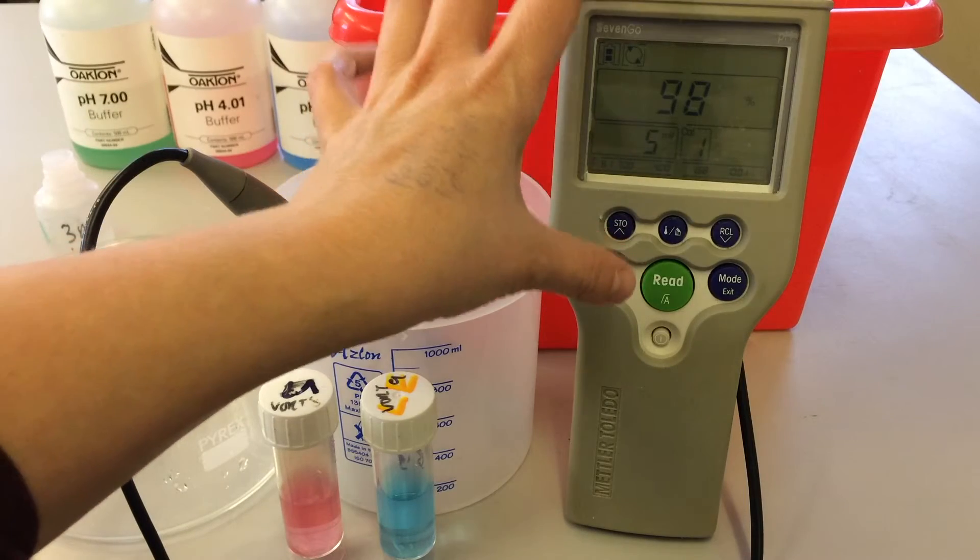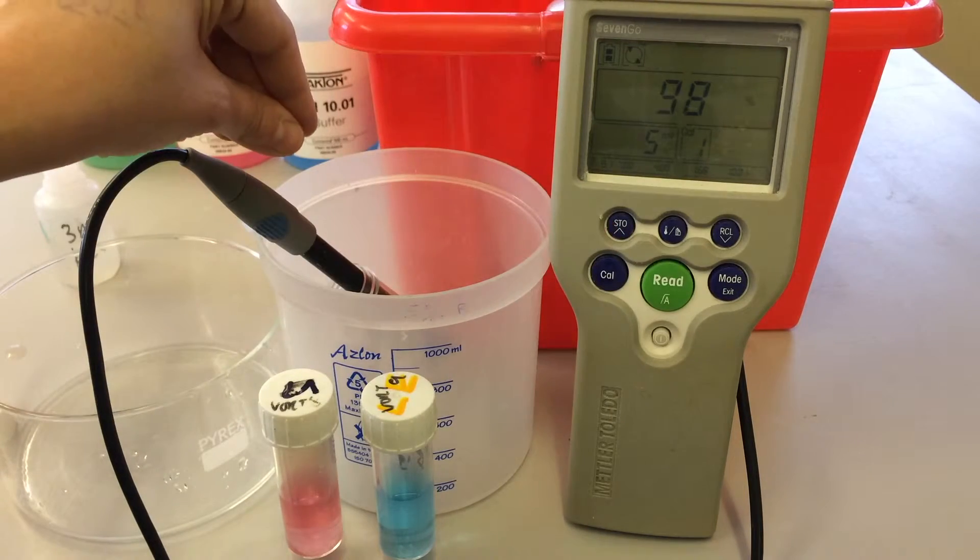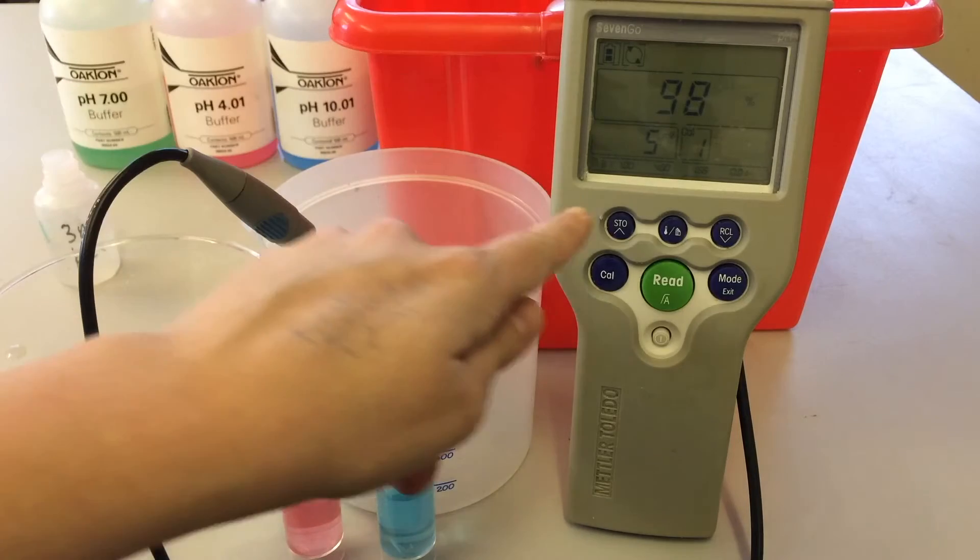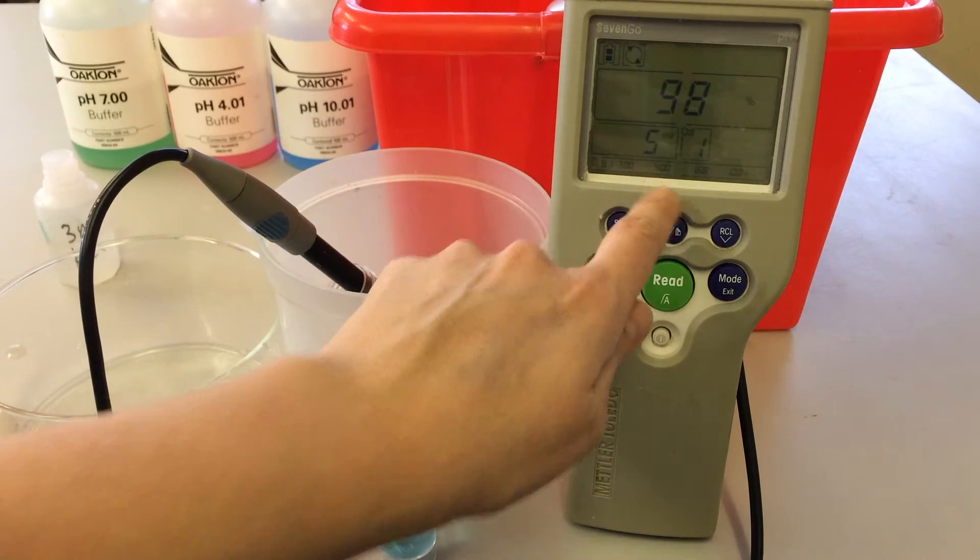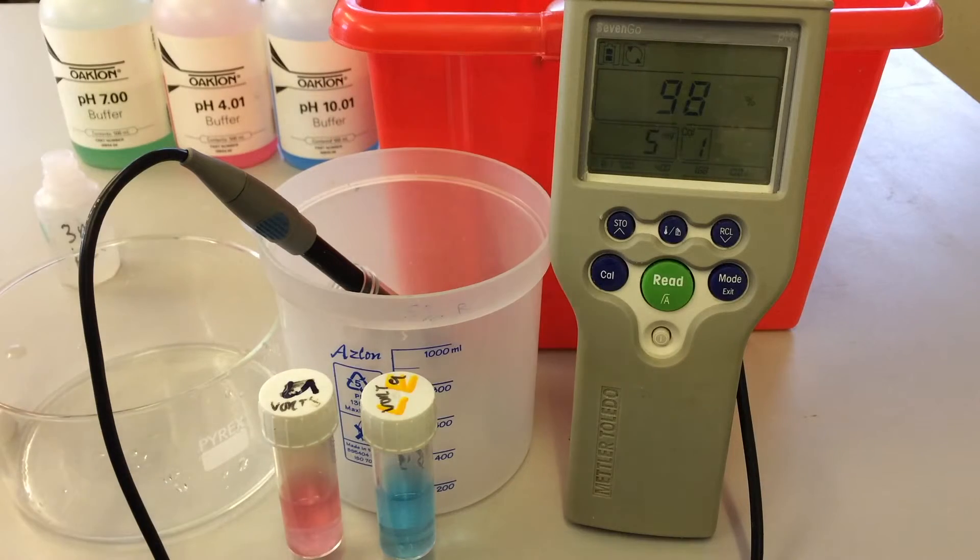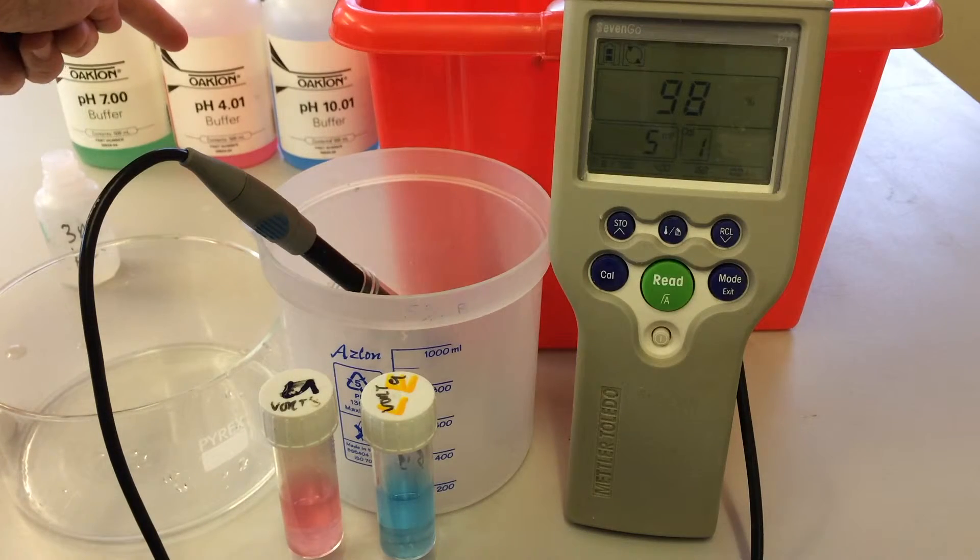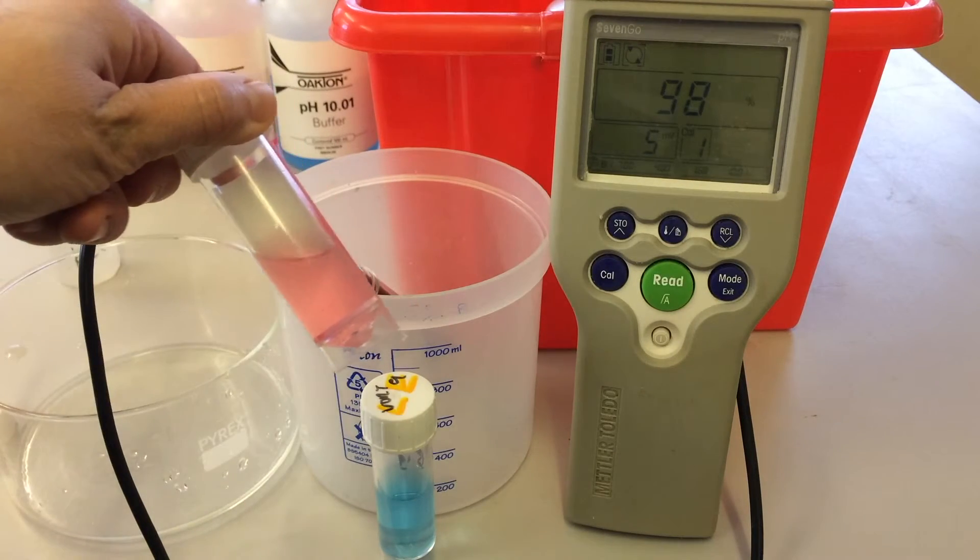So it's at this stage, once we get that percentage value, that we can now take this probe out of the buffer and take it to the next one. So remember I was talking about the order here, so we've done seven and now we're going to do four. So four is this pink one just here which I've already decanted into this little one.